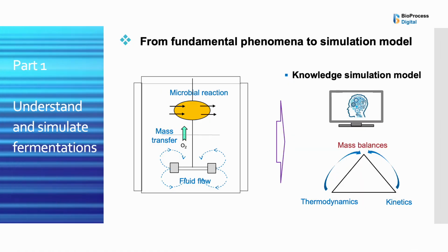In the first part of the course, you will gain a solid understanding of bioprocess engineering principles, concepts and methods relevant to microbial fermentations. You will explore the key phenomena that affect fermentation processes and advance in developing the fermentation simulation model based on fundamental knowledge.